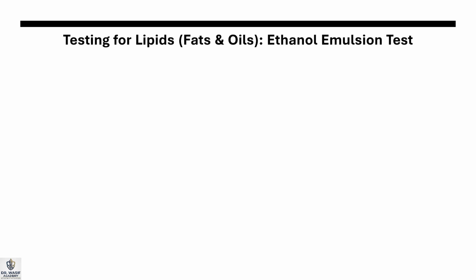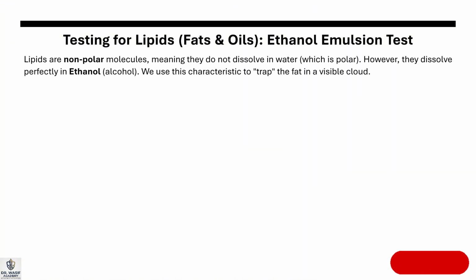Finally, we come to the ethanol emulsion test. Lipids are non-polar, which means they are water-fearing and would not dissolve in it. Why water-fearing? What is water-fearing? We have also another name for water-fearing. If you know that, comment that in the comments section.